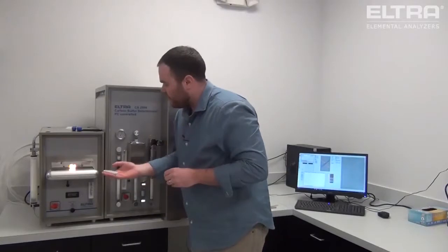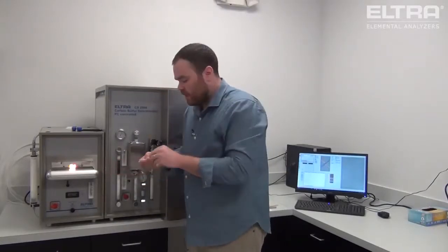For the resistance furnace, it is a horizontal furnace. You introduce your samples in two different boats. We have reusable ceramic boats here, but we also have one-time use ceramic boats as well.